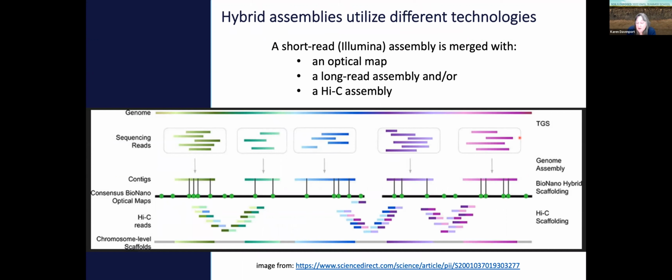If you have the opportunity to add another technology to your short read data, you can get complete or near complete genomes.